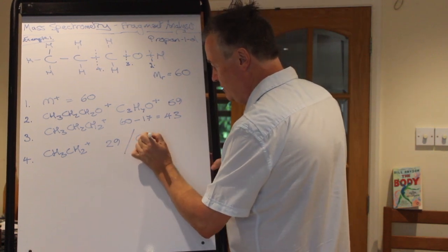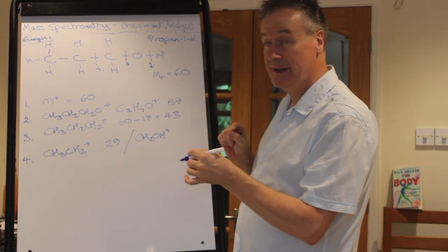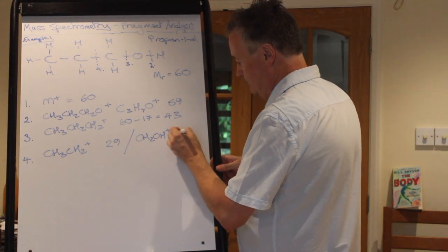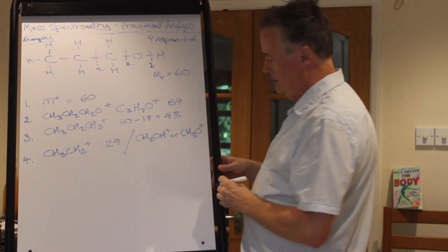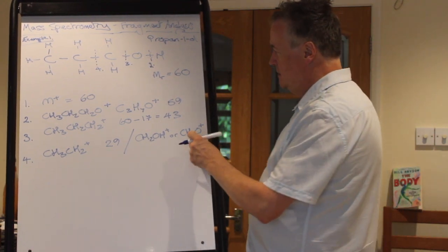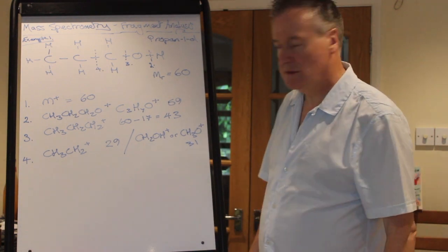So we would have CH2OH there, plus, as the other alternative way of doing split number 4. That is CH3O, that's 15 and 16, that's 31. So 31 taken away from 60 is 29, so there's always a reference back to where you started.